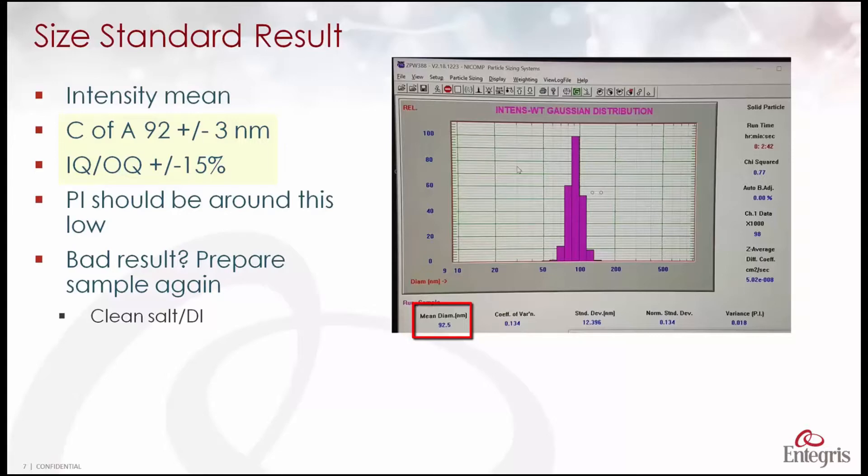If we're doing the IQOQ procedure in the pharmaceutical industry, the range we're allowed here is plus or minus 15 percent. So we actually really nailed this result.